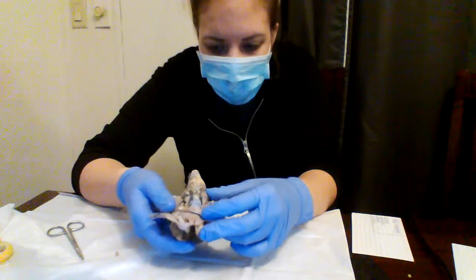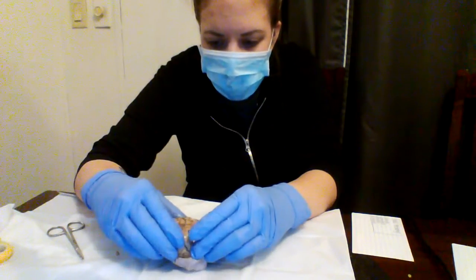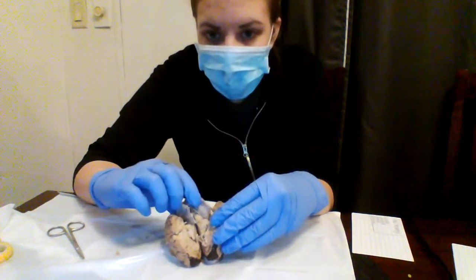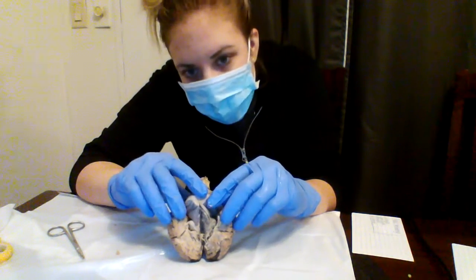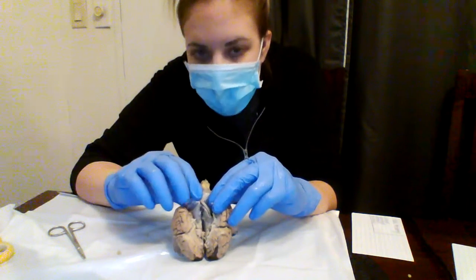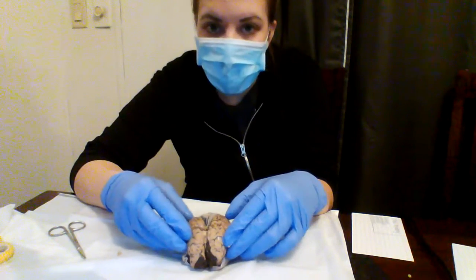It's a little bit hard, but it's really squishy, and without tearing it too much, I was trying to show you the different areas of it. These would technically be like the different lobes and stuff like the human brain. Anyways, that's the sheep brain.